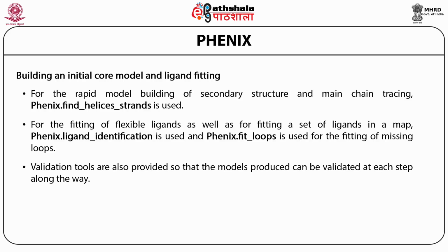Validation tools are also provided so that the models produced can be validated at each step along the way. So numerous research publications have been made by Professor Tom Terwilliger and also by Paul Adams, the two principal authors of this suite called Phenix. So we have Resolve, which does the model building. So this is a part of the Phenix suite.